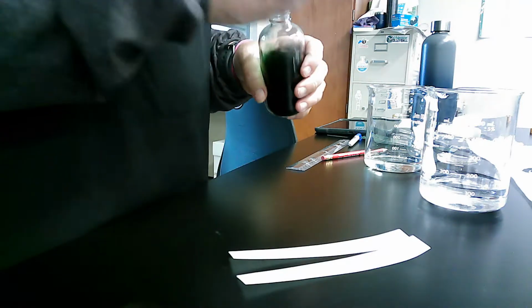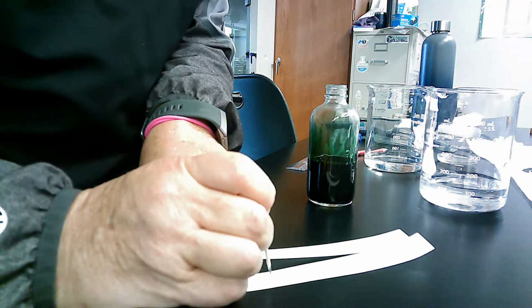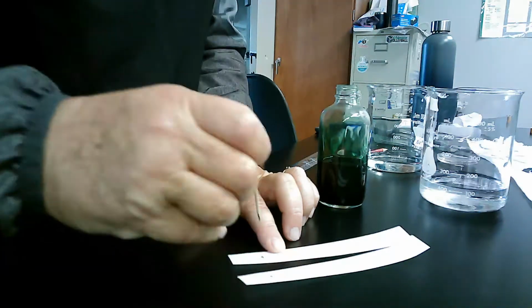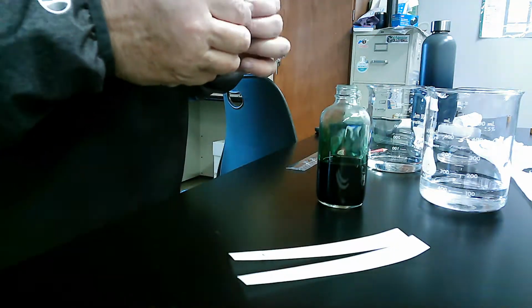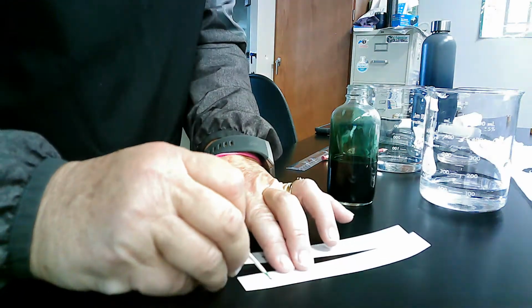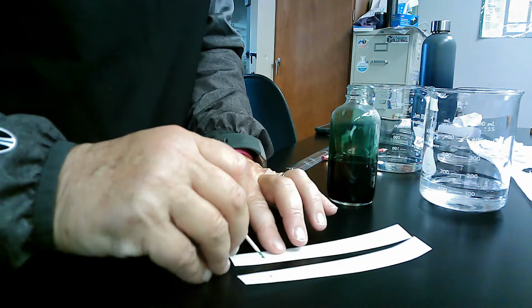To get my ink, I'm just going to use a toothpick, get some on it, and then I'm going to touch it to the paper and let that ink with the dye get on there. Now I'm going to do that multiple times so that I get it nice and concentrated.